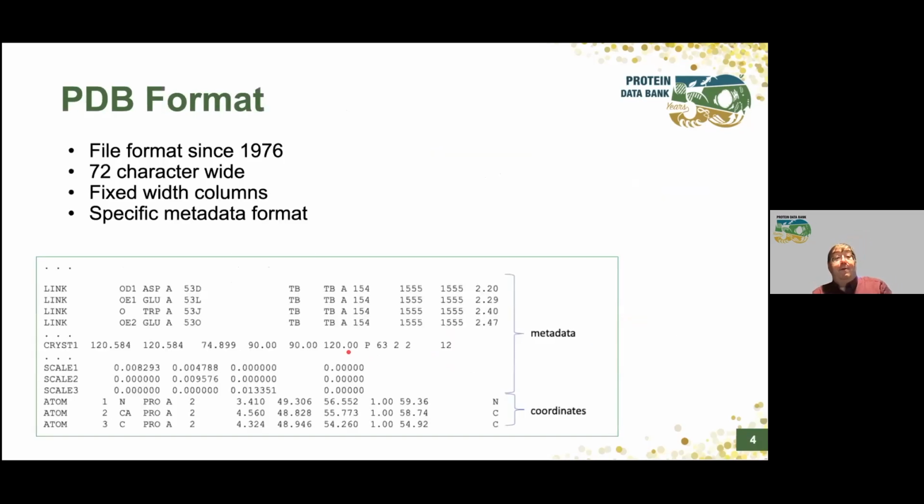So the PDB format, which has been in wide use since 1976, is the fixed width 72 character wide data format. This is a sample of part of a PDB entry, 3LTQ.